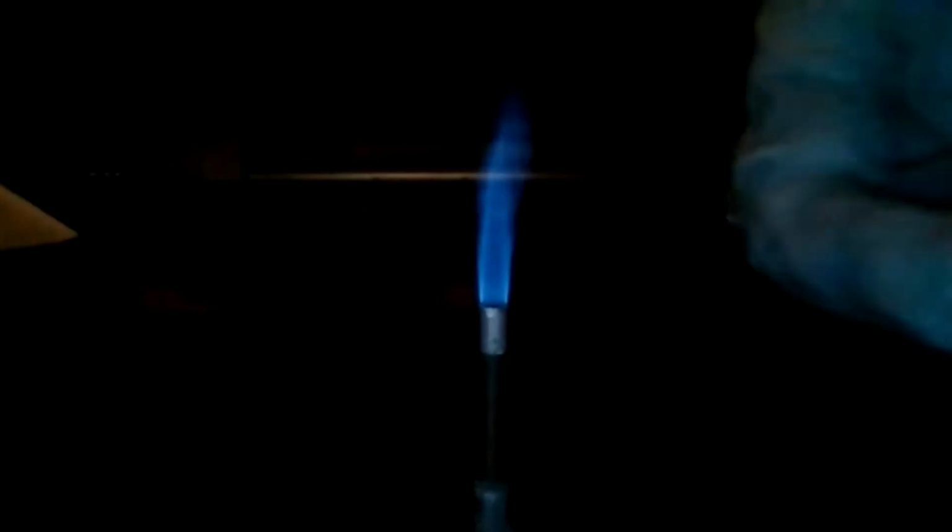One second, having some trouble getting the calcium on there. So in this case, is the flame really changing color? No. So what can we say? What color is it burning? Oh, wait. Blue. Do you guys see that?